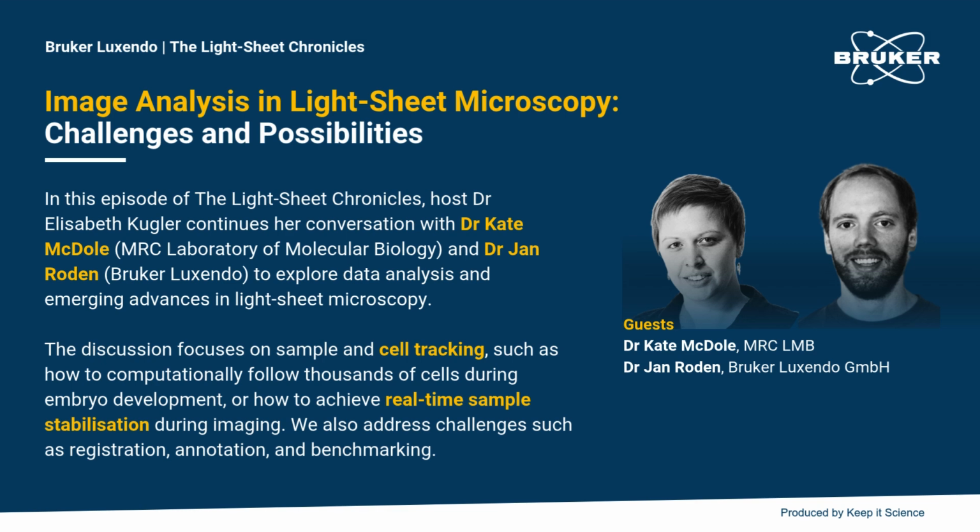What we are trying to do is make this first step of the post-processing as good as possible over time, so that all the other steps of the pipeline that Kate described, all these sophisticated steps with tracking and AI and so on, can be based on already well-aligned, post-processed data. So that's why I think it's quite crucial to have a good registration as a first step of the pipeline.